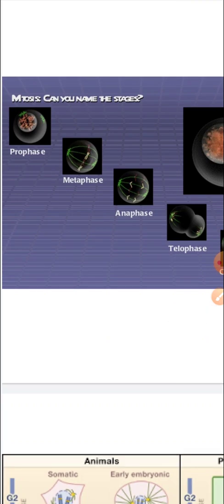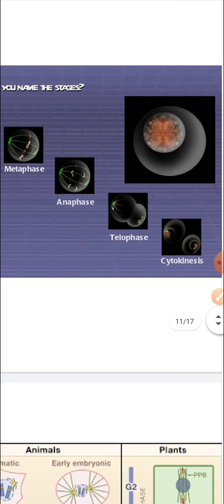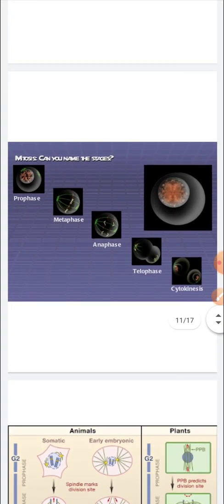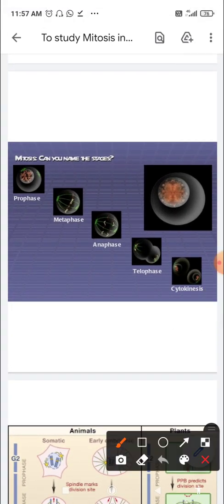This is the various stages again in different forms. I have tried to show you where you can locate the various stages, very nicely shown over here. This is the interphase stage, right? You can see the thickening starts taking place. Prophase, metaphase, spindle fibers are formed, centrioles are there, asters are there, right? Nuclear membrane has disappeared, nucleolus is not there, and the chromosomes have arranged on the metaphase.